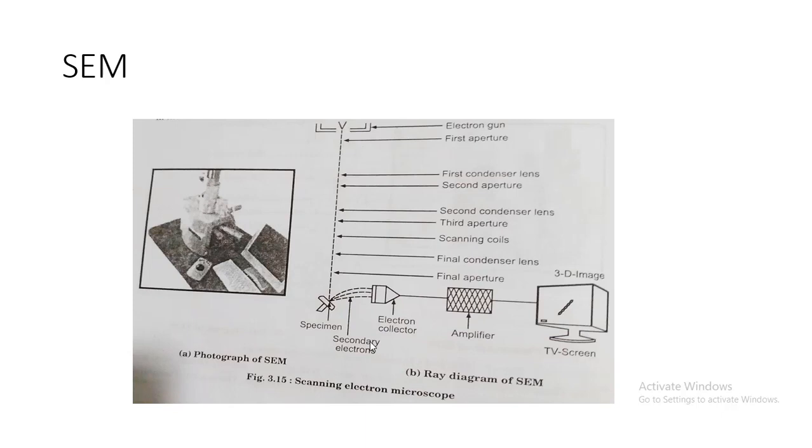The intensity of these secondary electrons depends on the shape and the chemical composition of the irradiated object. The secondary electrons are collected by a detector, which generates an electronic signal. These signals are then scanned in the manner of a television system to produce an image on a cathode ray tube. Scanning electron microscopy gives a three-dimensional view of an object. The surface topography of the specimen or object can be revealed with clarity and depth.